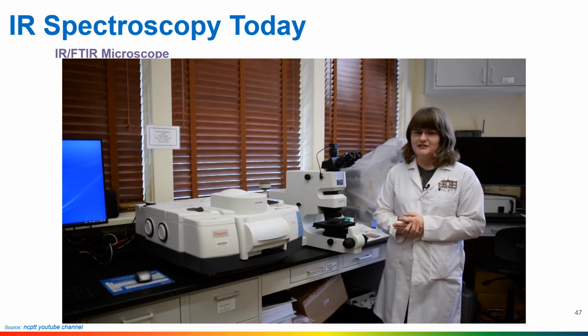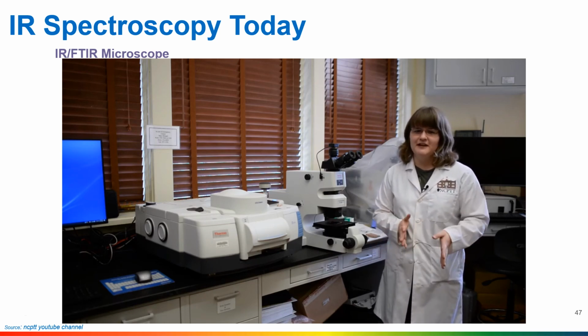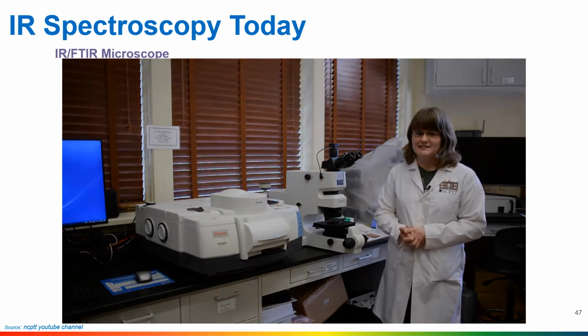So the microscope actually uses liquid nitrogen, which I'll be demonstrating in a little bit, to help keep it cool and prevent it from overheating as we're running these tests.